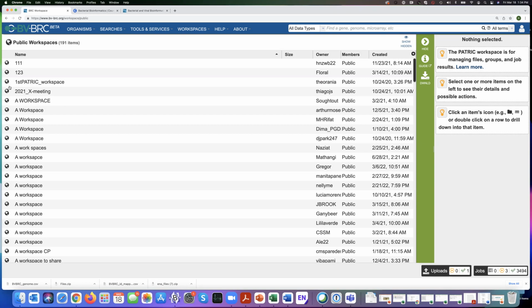But when you're working together with data, you want to share your experimental results, and that's a little bit different. You can move data in there, but the people can't actually see the genomes or analyze the annotated genomes unless you specifically share those with people. So first let me show you how to share a job.